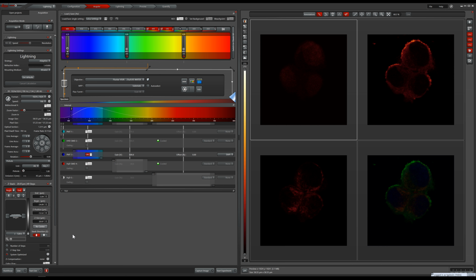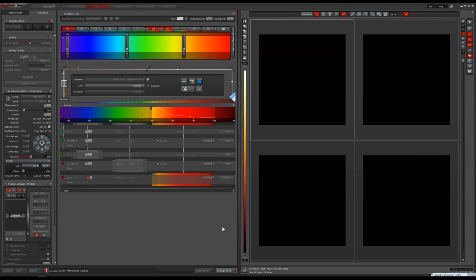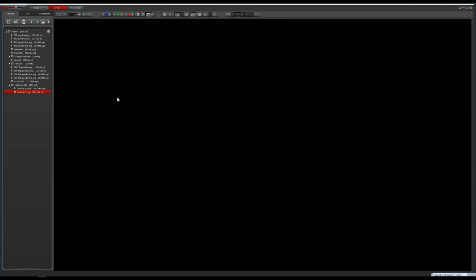Now, we can start the experiment and acquire our confocal as well as Lightning stacks at the same time. In some instances, using Lightning might even speed up your Z-Stack acquisition. In your project, the first file under the Lightning dropdown is your regular confocal stack, and the file with an _LNG suffix is your 16-bit Lightning stack. Comparing these two in the 3D viewer shows the further improvement in image quality after Lightning.